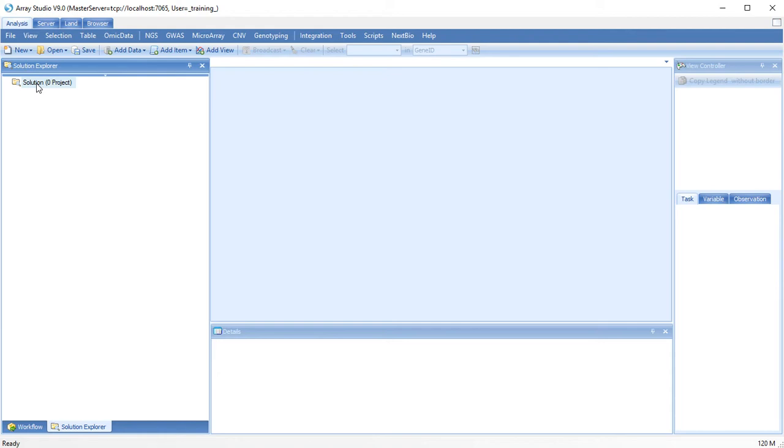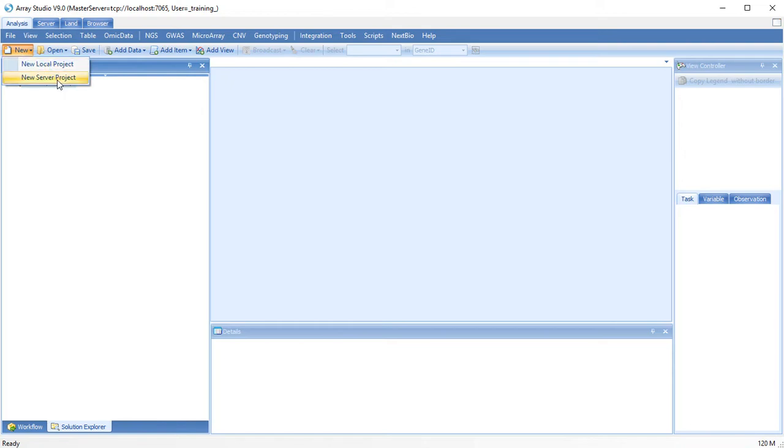Let's create a new project for our RNA-Seq analysis. Users have the choice of making a new local project, or if they have access to an array server, a new server project.